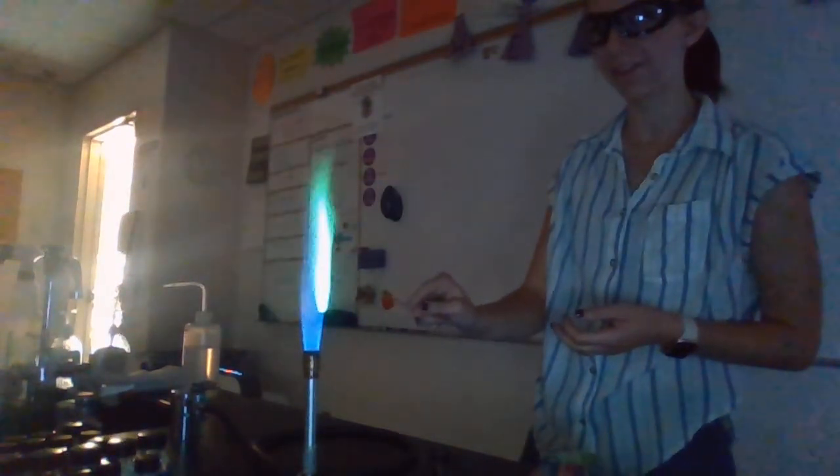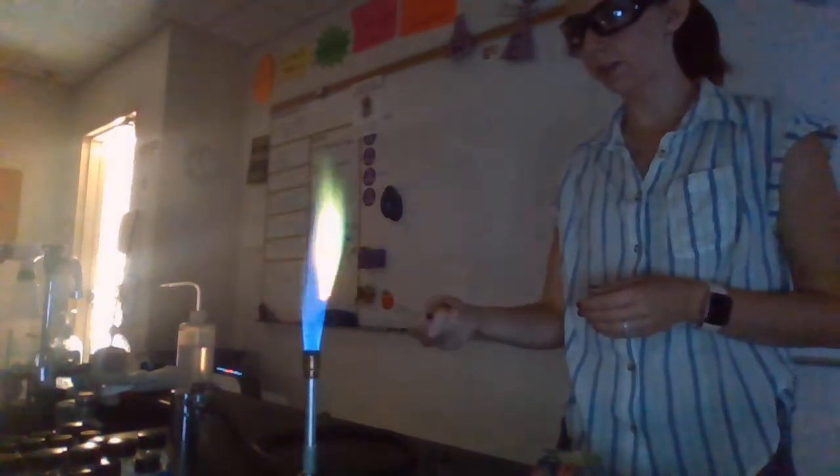And number 1, here we'll try number 1 really quick again, see if we can see a better color there. Still got some green on from the last one, but here's the more red color for the first one. Oh, and then we got green left over from the second test. So green is the second, and red is the first one. So we'll try and rinse off our wire, make sure we don't have anything left over, so it doesn't contaminate the colors. Oh, we still got some red and some green left on there of our salts.